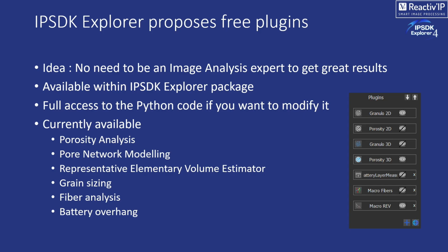So that's when we decided also that all the plugins are available with the IPSDK package. So you don't need to purchase that, it's part of the package. And if you want to change it, we propose you a plugin, but you can optimize, change, modify, integrate this plugin on demand. You can do that by yourself, or you can ask us to do that.